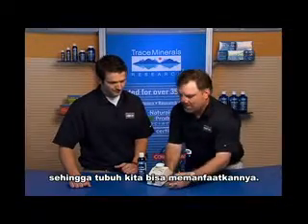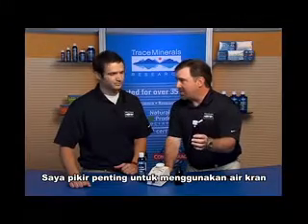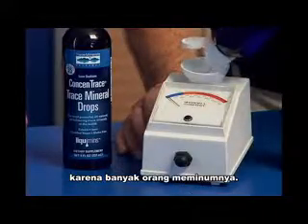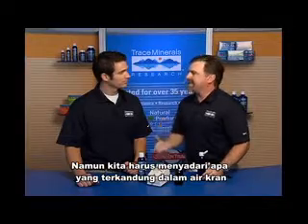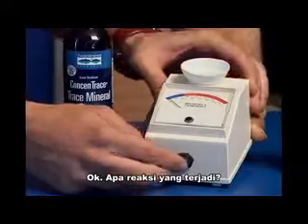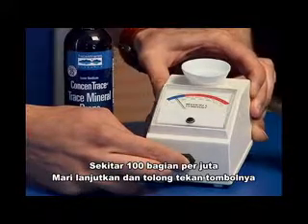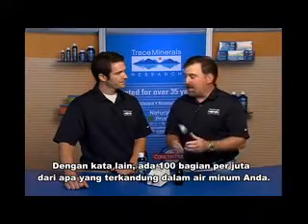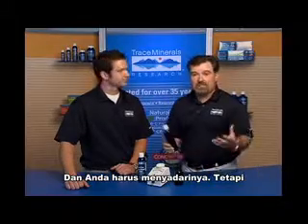Well, in this case, what this device will do, I'm going to go ahead and take tap water. I think it's important to use tap water because a lot of people drink it, right? Obviously. Well, probably not enough, but even in tap water, we should be aware of what's in tap water. Yeah. So in other words, let's go ahead and push that button. Okay. And what response? About 100. That's parts per million. 100 parts per million. So in other words, there's 100 parts per million of something in your drinking water. Yeah, right. And you should be aware of that.